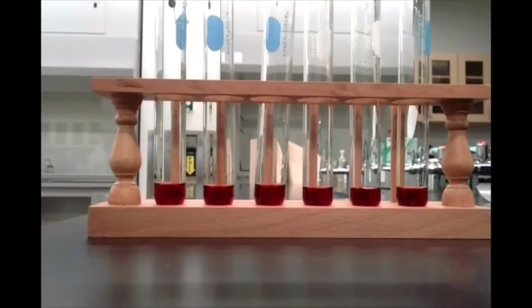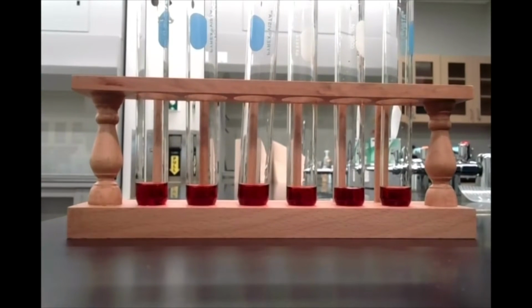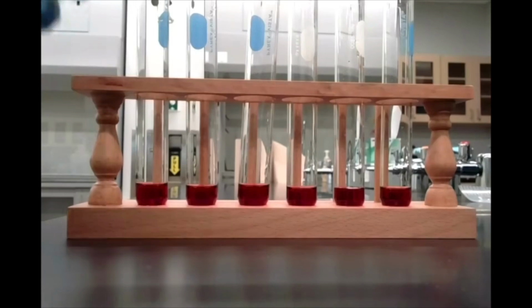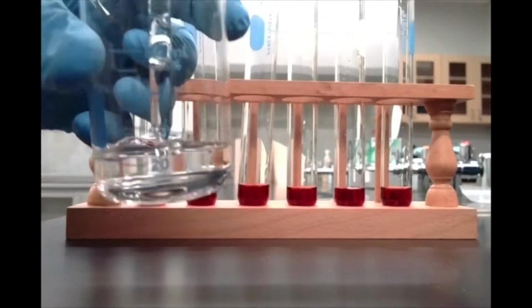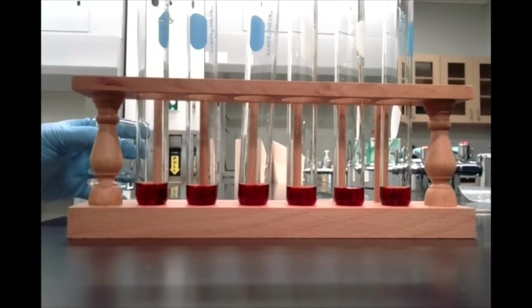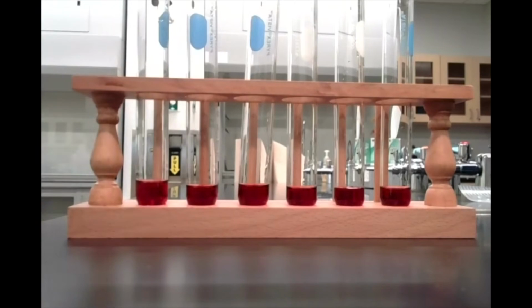All right, you can see here that I've added about 3 milliliters of the solution of our equilibrium mixture to our 6 test tubes. Now, to our first one over here on the left, I'm going to add 10 drops of just plain distilled water. And we're going to use that as our reference test tube. There we go.